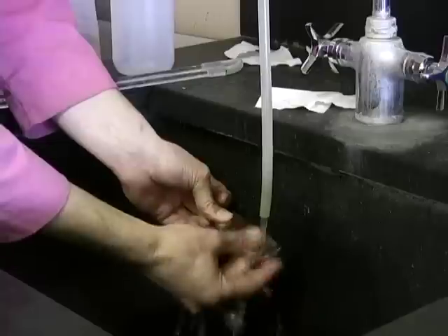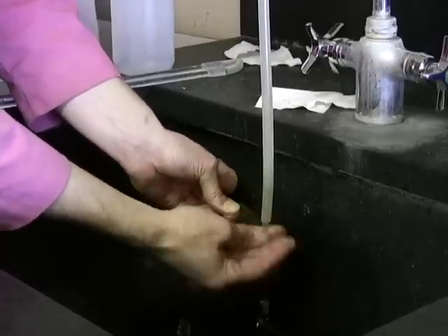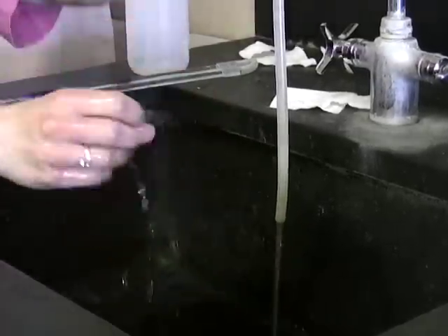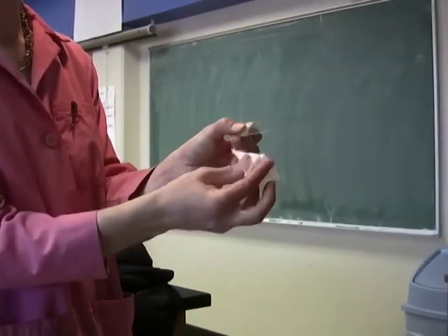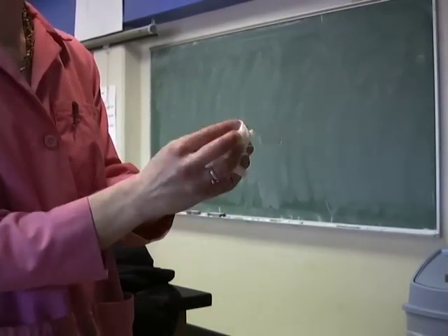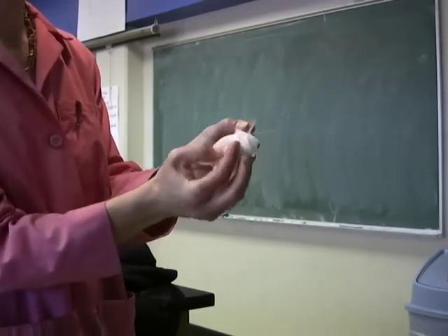This will be really an important thing for your unknown, because you'll be using a broth culture to make the smear, and you want to be absolutely certain that it will adhere to the slide. Thoroughly dry the slide once you've washed it, and now you can actually put the broth culture onto your slide.